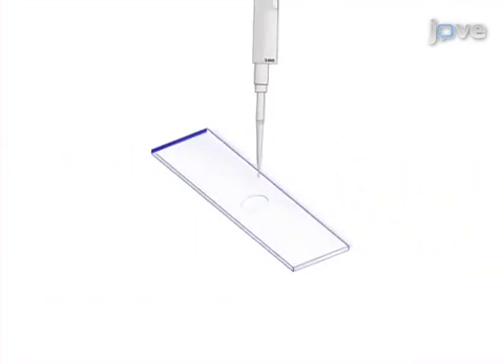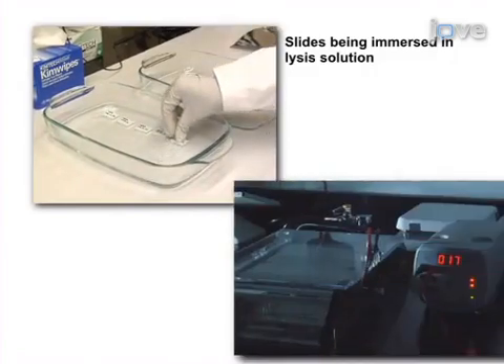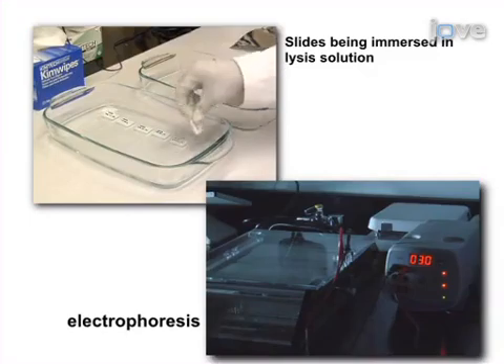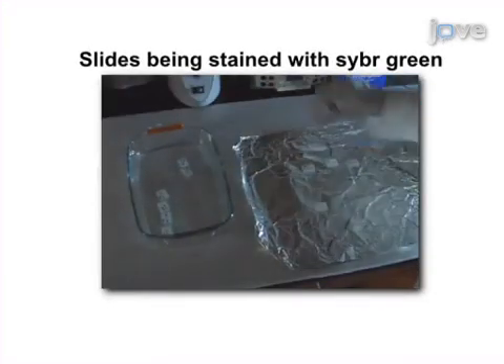The second step is to immobilize the neurons on slides. Next, the neurons are lysed and then subjected to electrophoresis. In the final step, the DNA is stained with CyberGreen.